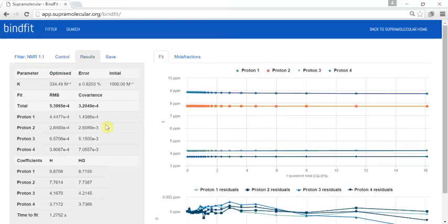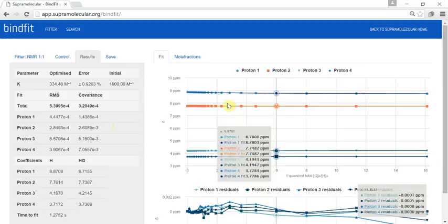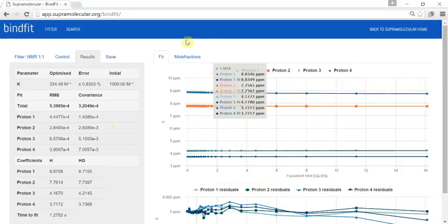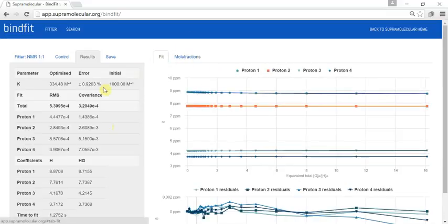Within a very short period you will see the results on the screen, including the residual plot, the mole fraction, and most importantly the binding constants themselves and other associated data.